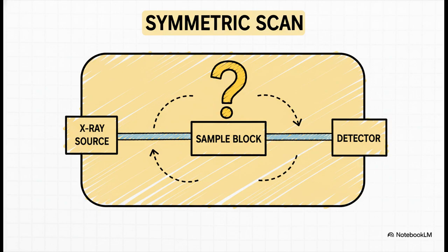Okay, first up in our toolkit is the symmetric scan. This is your ground zero, the fundamental measurement you pretty much always do first. It's like asking the most basic question you can. What is this stuff anyway?